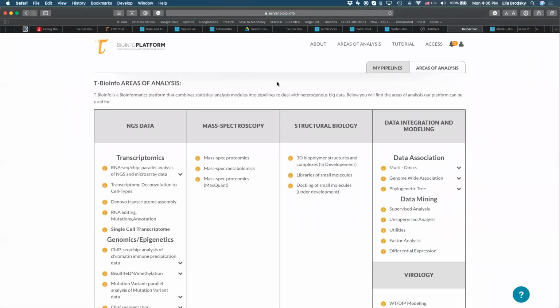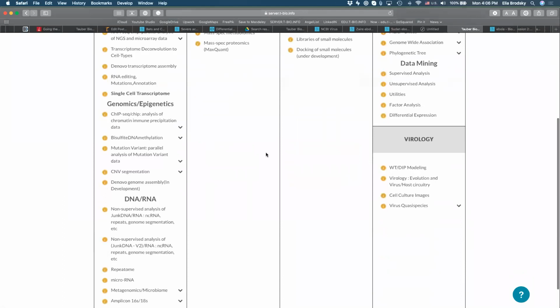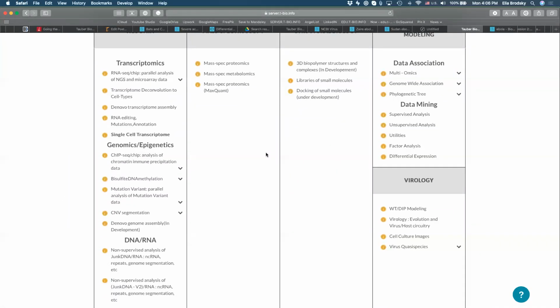Okay, so we already used this last time, so all of you are probably familiar with analysis stages. And here we have two different sections dedicated to phylogenetic analysis. Phylogeny is not just for viral sequences, so you can use it for distances between genes in different species, for example. One interesting analysis in the context of SARS-CoV-2 might be comparison between ACE2 receptor sequences in different species. Or we can look at distances between specific viral proteins. So we don't have full genomes, we only take a specific protein that we're interested in. For example, the spike glycoprotein, important for cell entry, that might be interesting to compare.